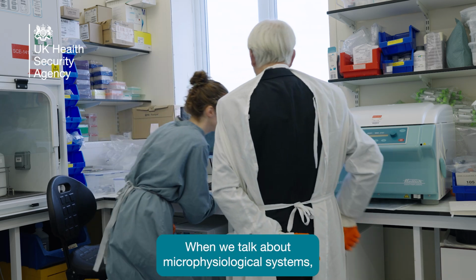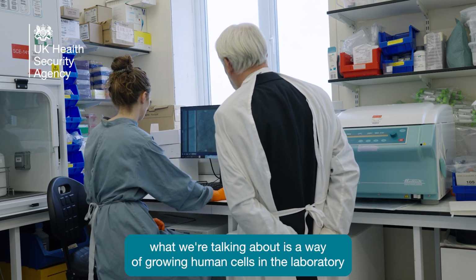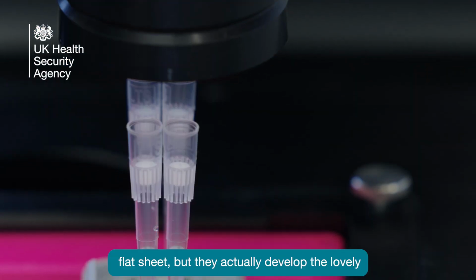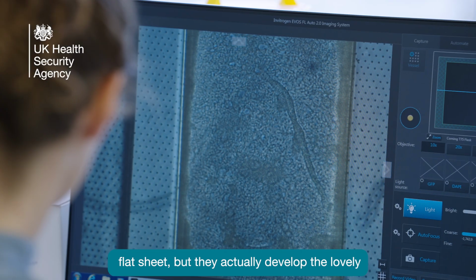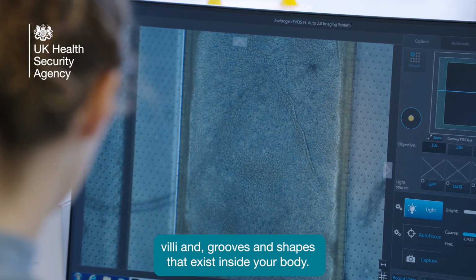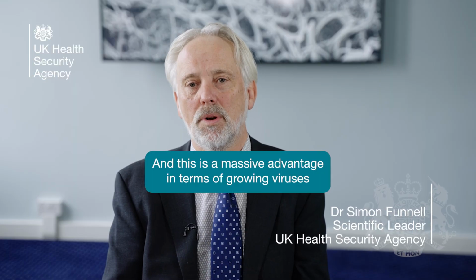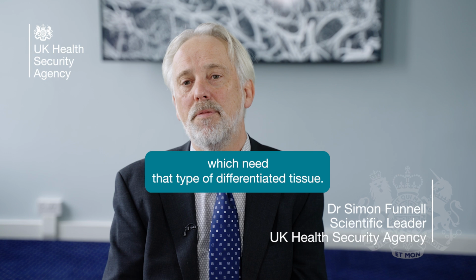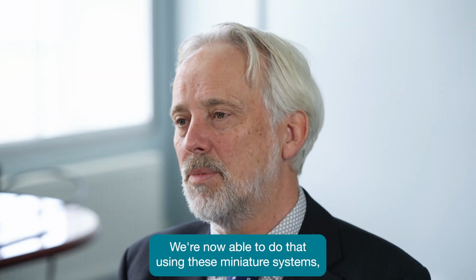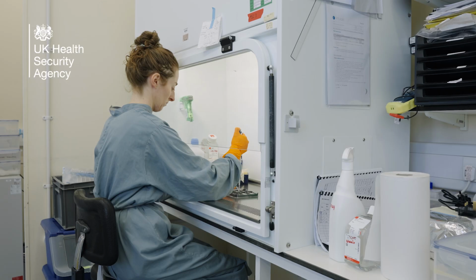When we talk about microphysiological systems, what we're talking about is a way of growing human cells in the laboratory in such a way that they don't just grow in a flat sheet, but they actually develop the lovely villi and grooves and shapes that exist inside your body. And this is a massive advantage in terms of growing viruses which need that type of differentiated tissue. We're now able to do that using these miniature systems which we can interrogate with some very sophisticated tools.